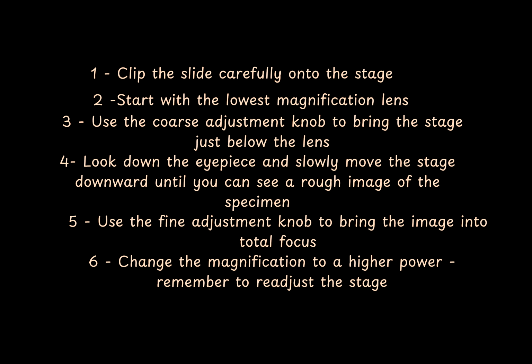In your exam, you could be asked to describe how you would use the microscope to observe a prepared slide. These are the steps that I shared with you just now. They're in one place. Take a picture of it or write down the points. Students, this is one of the required practicals in paper 1 that students do poorly on. They find it challenging to write the steps. Write the steps down or take a picture of it and use it in your revision.